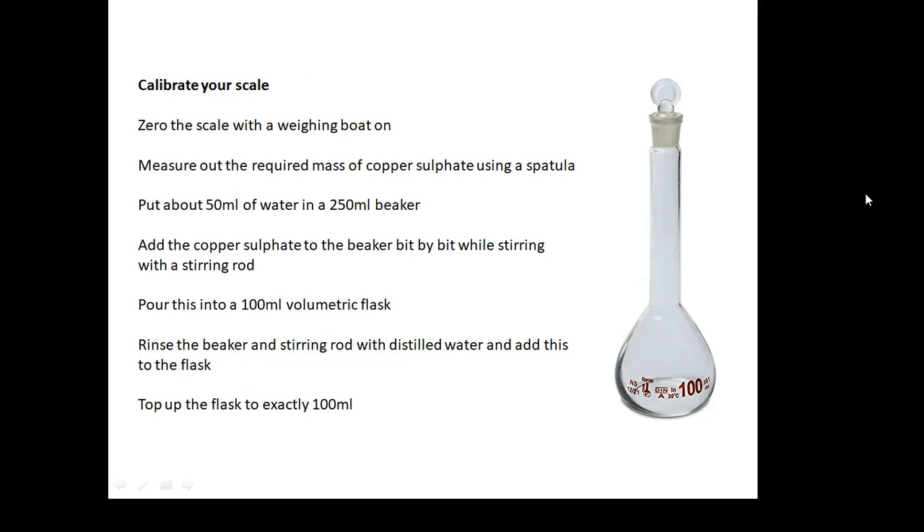So, preparing the standard solution — here's a method for doing that. Zero the scale with the weighing boat on. Calibrate your scale first — look it up. Measure out the required mass of copper sulfate using a spatula. Put about 50 mils of distilled water in a 250 ml beaker. Add the copper sulfate to the beaker bit by bit while stirring with a stirring rod. Be careful — if it's anhydrous it might fizz a little, so add it bit by bit. Don't just chuck it all in or you'll end up with a rock of copper sulfate at the bottom of the beaker.